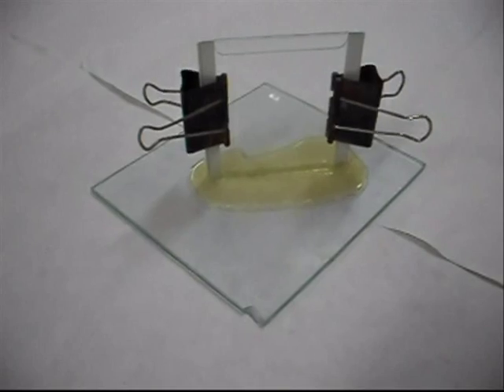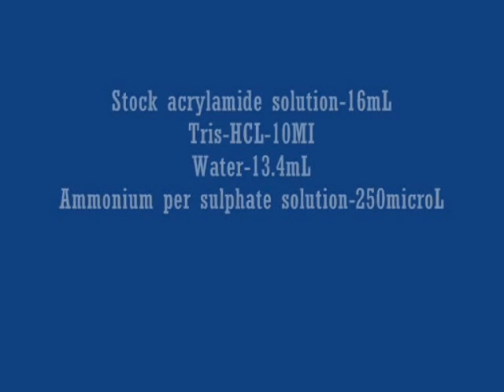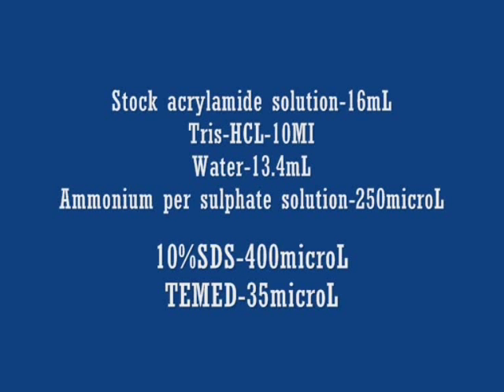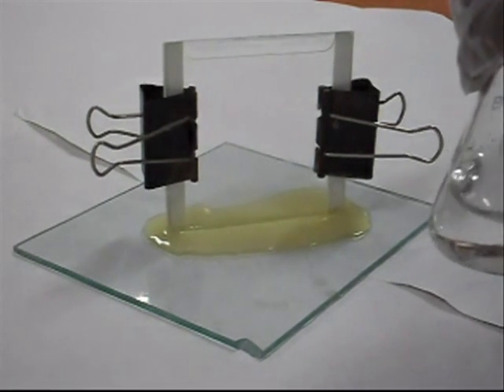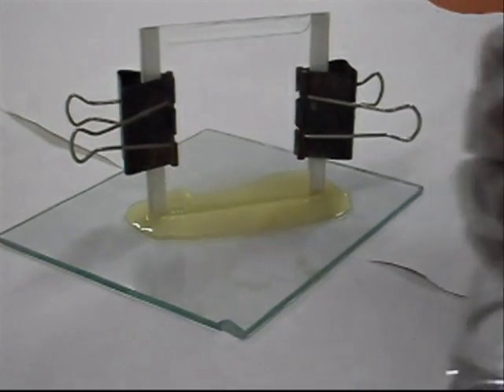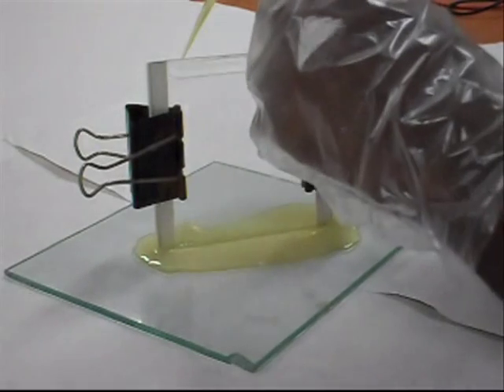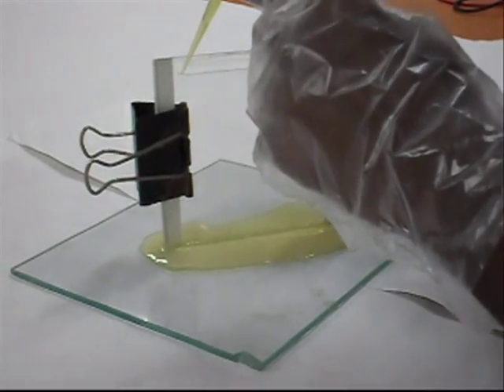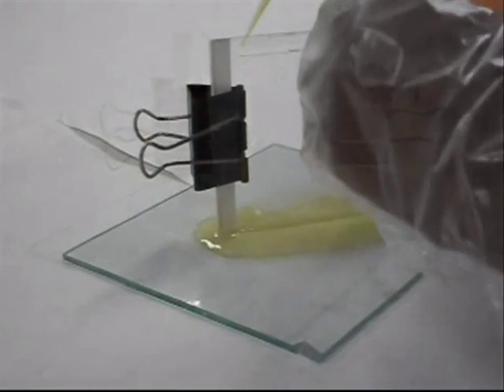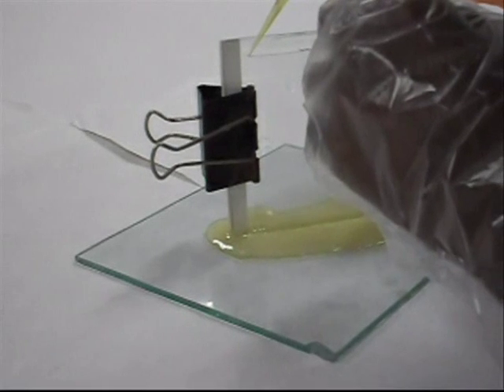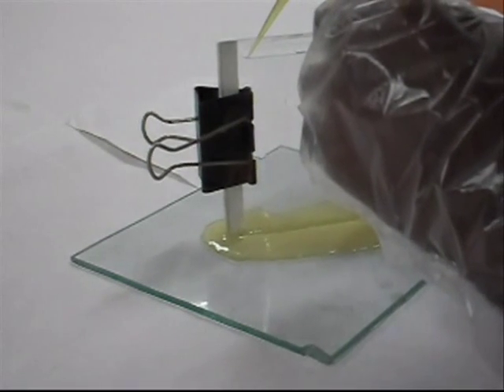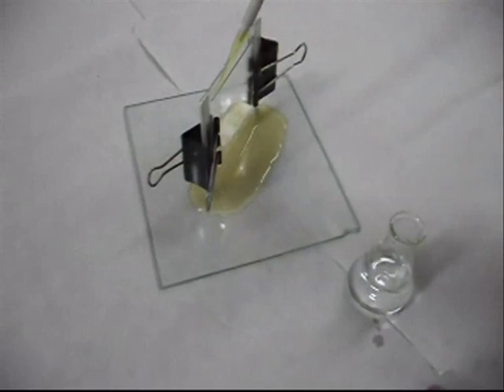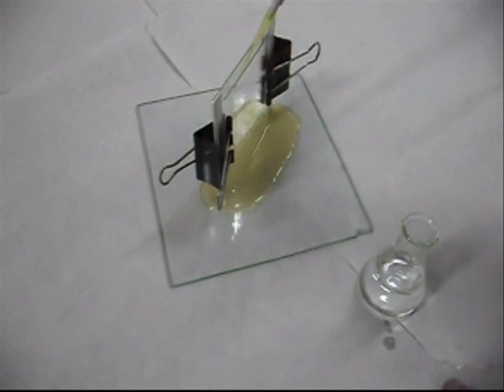The separating gel is prepared with the following chemicals. All these ingredients are mixed in order to form a solution mixture. The separating gel is poured into the plate assembly using a pipette. Water is added to adjust the separating gel.